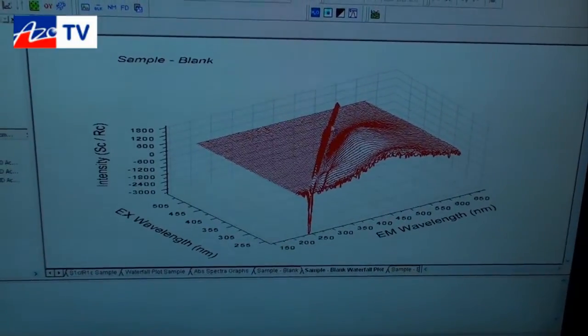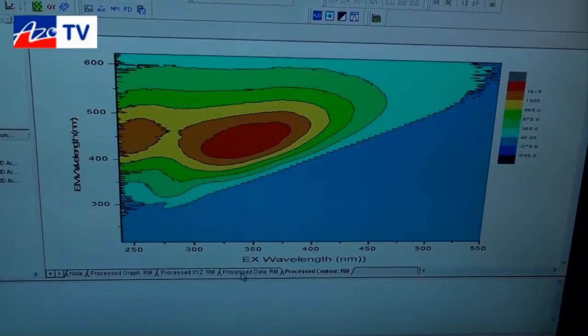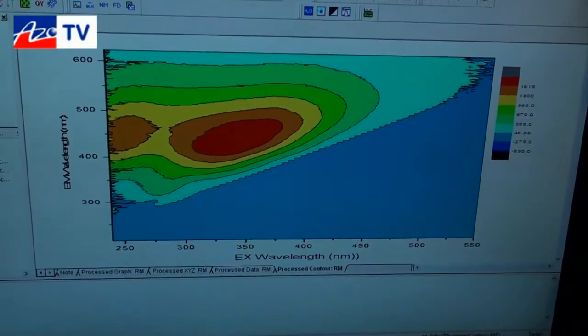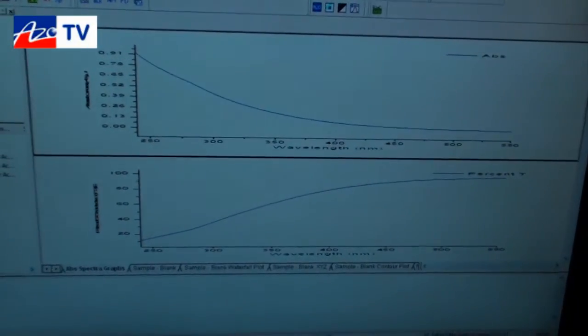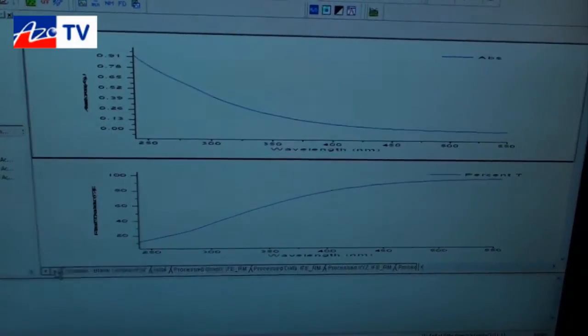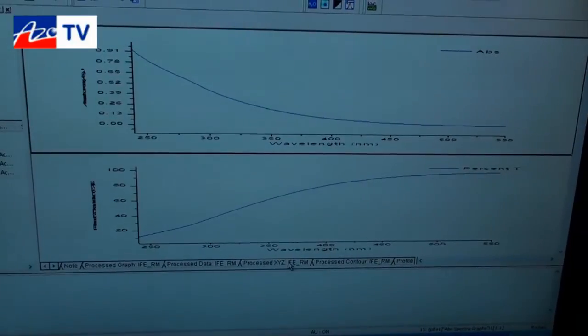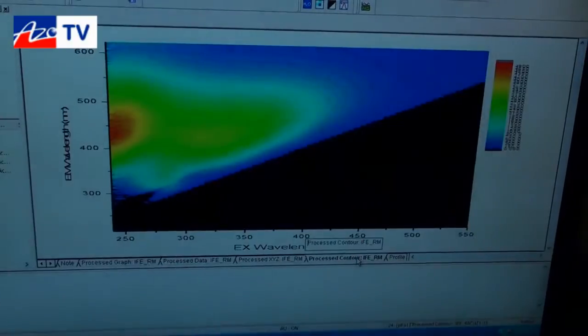So this is a raw picture of the unprocessed data, then I'll walk you through some of the processing steps that we can apply. One of the processing steps involves the inner filter effect correction, and the inner filter effect correction can be followed by removal of the overlap band for the excitation and the emission.